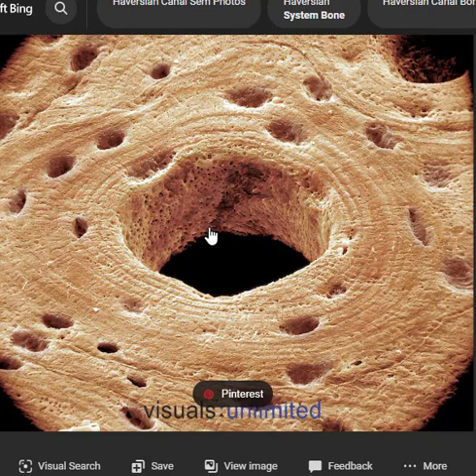They were in there. But what I like about this picture, can you look inside here? Right there, you see little openings all in this central canal, this Haversian canal. And the reason for that is you've got to get nutrients into these cells. So you've got these little teeny tiny canals, which we call canaliculi, and they're going in, so you're sending nutrients in to this cell, and if you were to be able to look inside there, you would see little cracks going up here, and so the nutrients can go up there, and so on.